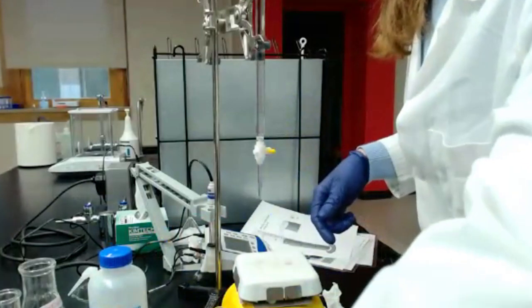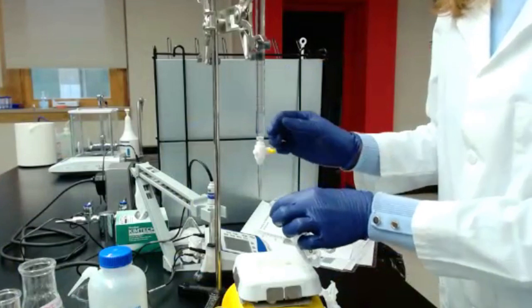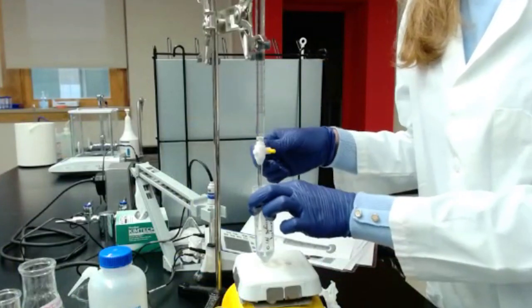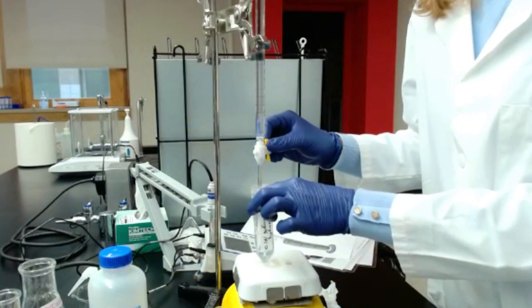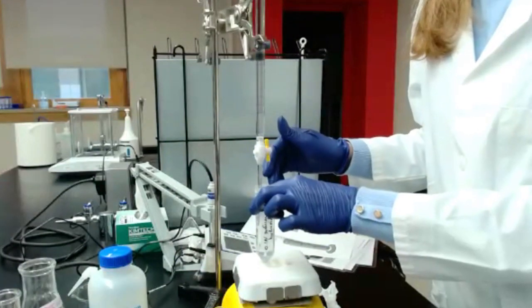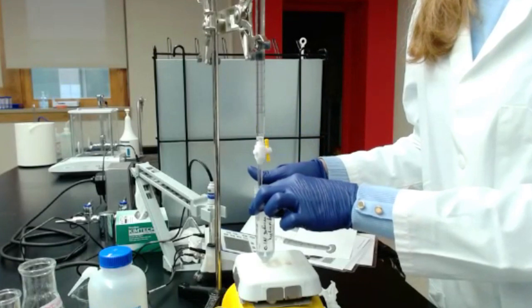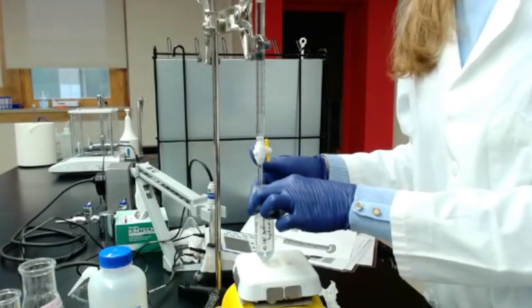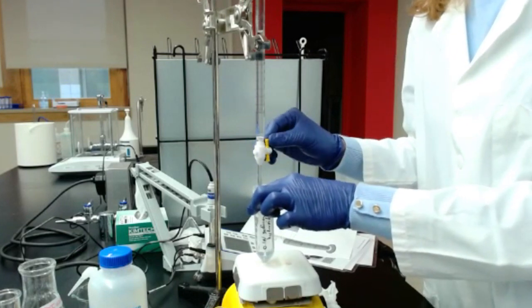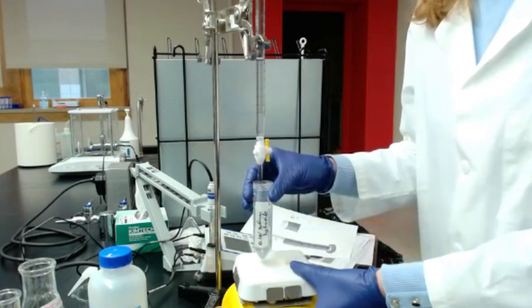And then you will need to make sure the burette is empty. So you will empty it. I'm just taking the initial container of sodium hydroxide. You can empty it in the trash, or you can keep reusing it. But make sure you don't wait too long between two uses, because at some point some water is going to be in contact with the sodium hydroxide solution, and the strength is going to be different. So make sure you follow the recommendation from the provider.